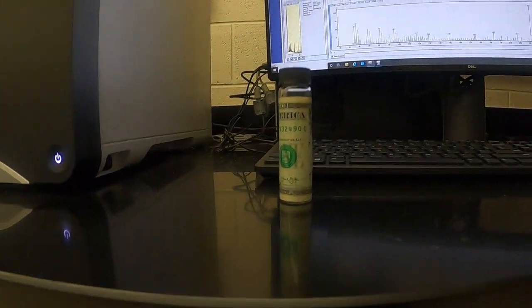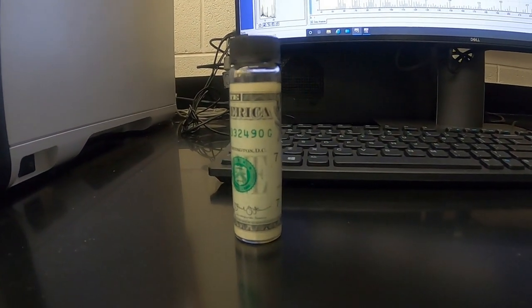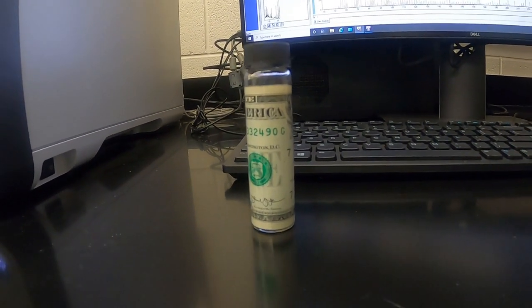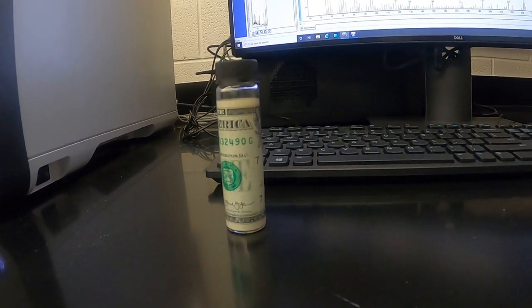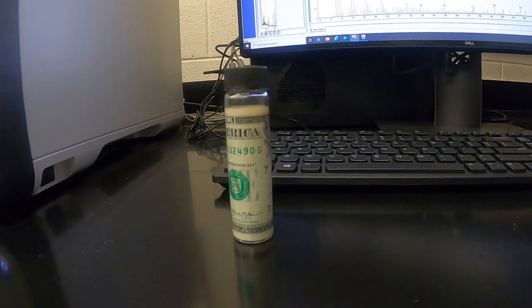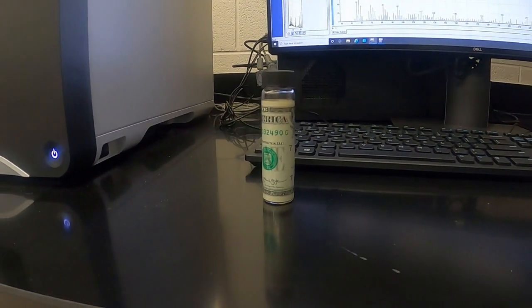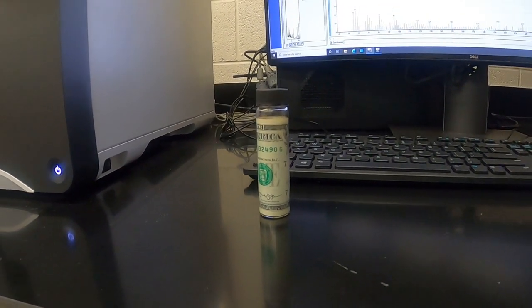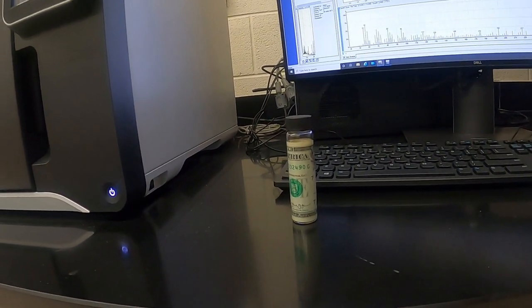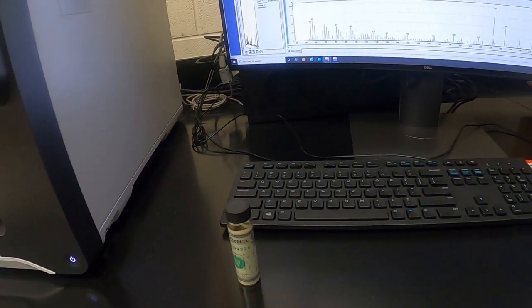Other applications of this for environmental analysis have included air sampling, water analysis, and soil analysis. The GC and ultimately MS can really be used for many types of applications related to chemical analysis. It's actually one of the more powerful tools in the lab. We have attached to it several different library databases comprised of about 1 million compounds. So anything that you want to analyze or characterize, this instrument can pretty much determine what it is.